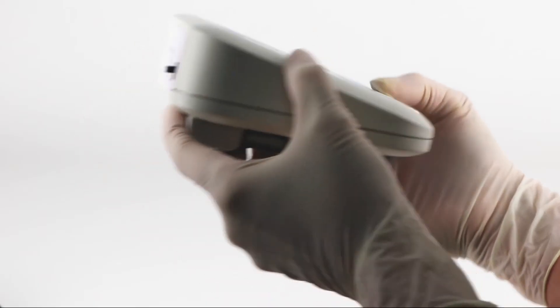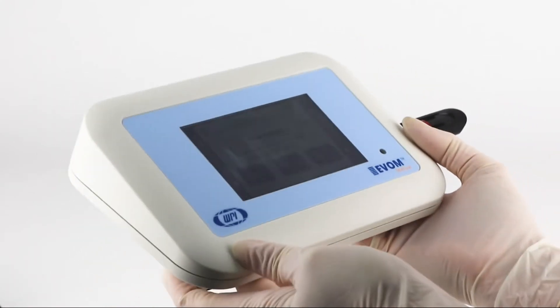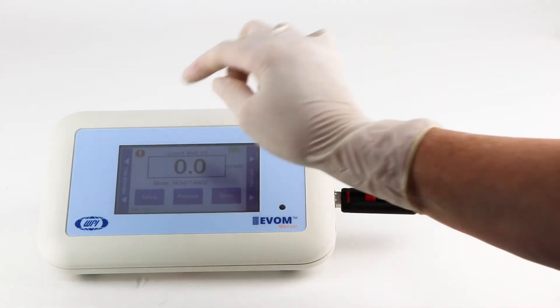Third, the small footprint frees up precious benchtop space and makes the EVAM Manual easy to store. Fourth, at the press of a button you can calibrate and verify that your system is functioning properly.